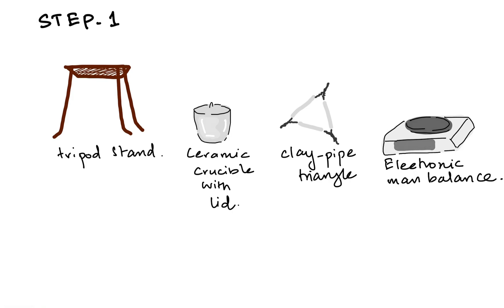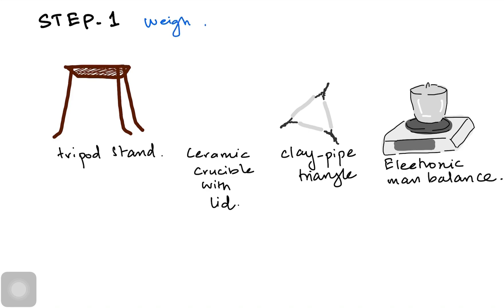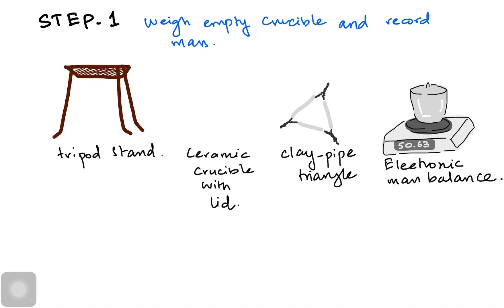In step 1, we put the empty crucible along with the lid on the mass balance to measure its mass. We weigh the empty crucible and record its mass. For example, the mass of the empty crucible turned out to be 50.63 grams.